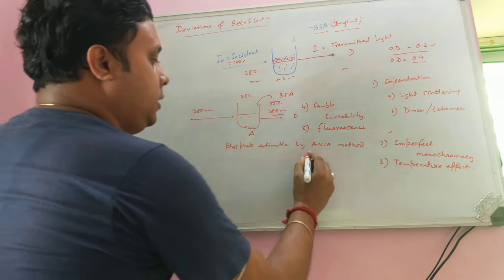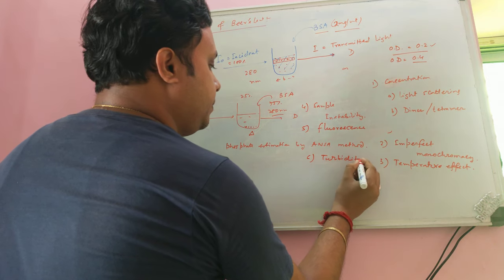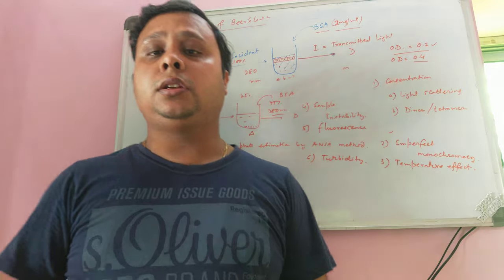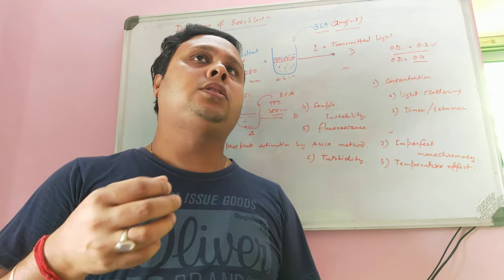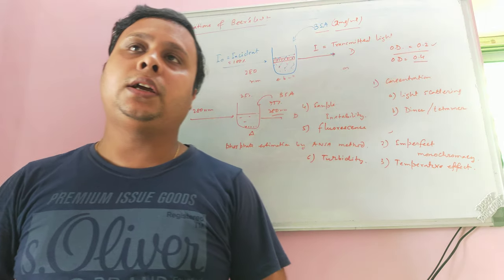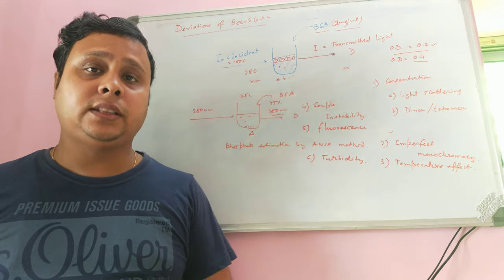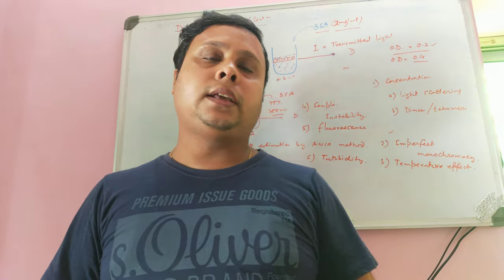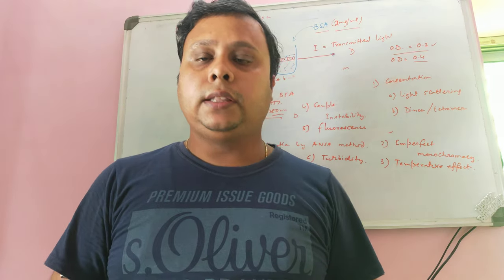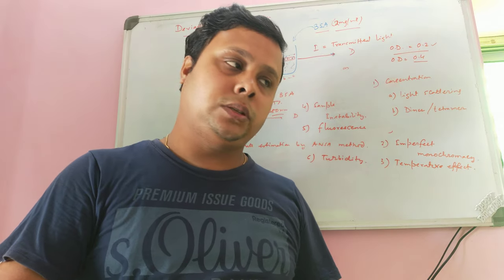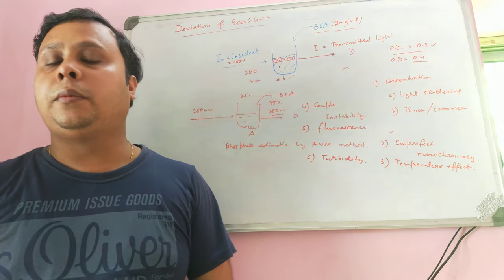The sixth deviation is turbidity. Turbid solutions will absorb more light than the native clear solution. For example, if bacterial cells are inoculated into a medium and turbidity develops, measuring cell number by turbidimetric method is complicated because not only bacterial cells are present, but also their metabolic waste products. The total OD measured will be far greater than the actual OD contributed by the cells alone.